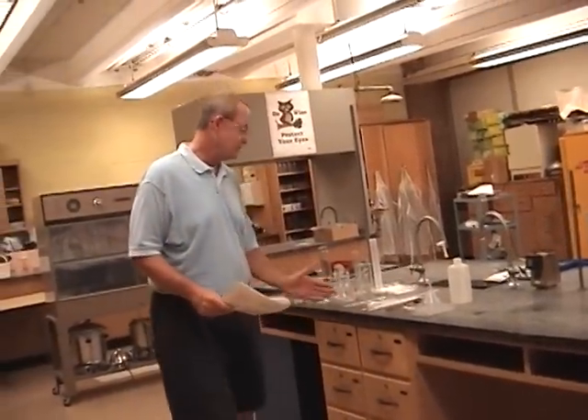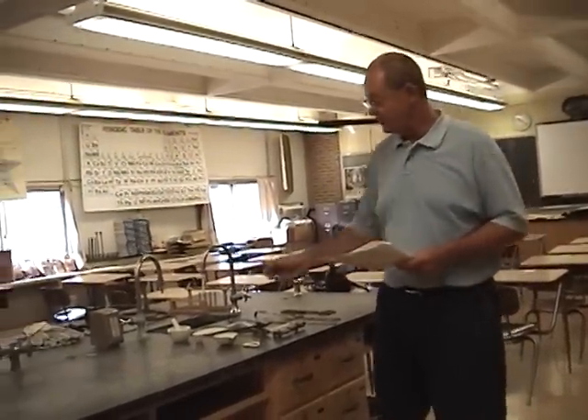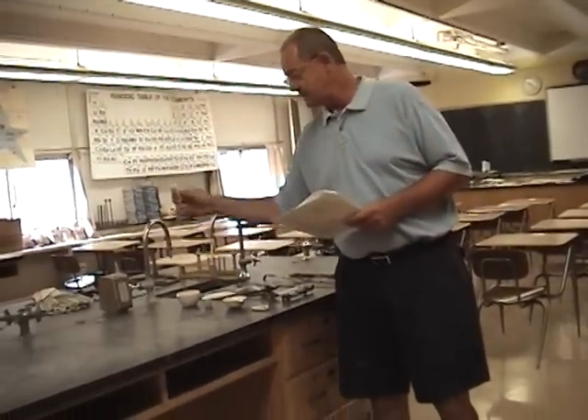That completes what's in lab Drawer 1 at every station. We're now looking at what's in Drawer 2. You probably noticed that everything in Drawer 1 was either glass or plastic, whereas everything here in Drawer 2 is ceramic or metal.